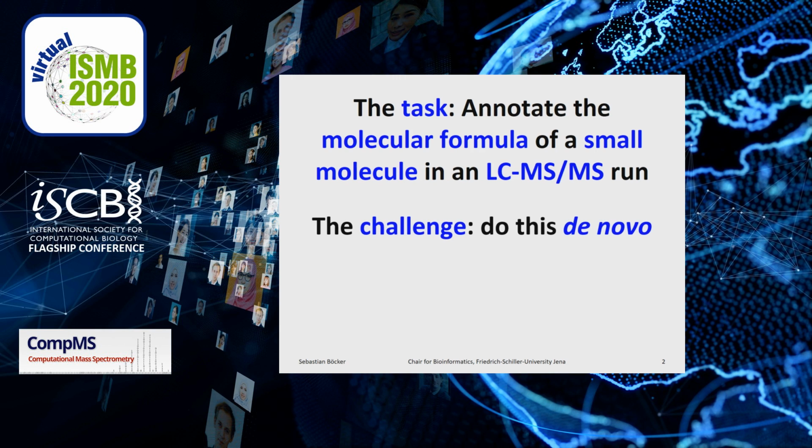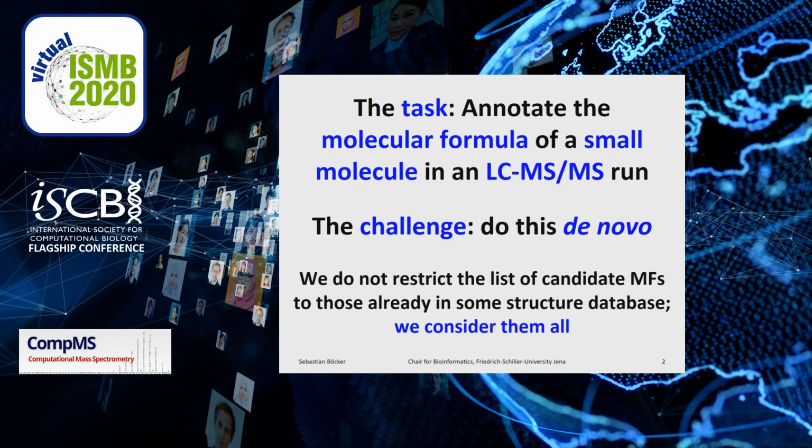That is, we don't want to look up the possible answer, the candidates from some, say, structure database, but we really want to consider all possible molecular formulas chemically feasible. And that makes it obviously much harder since we do not restrict ourselves to a small set of candidates.